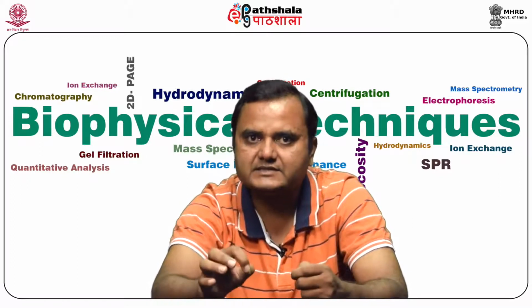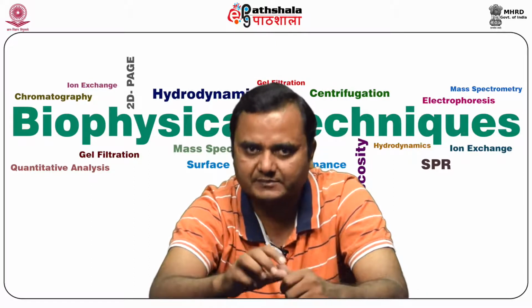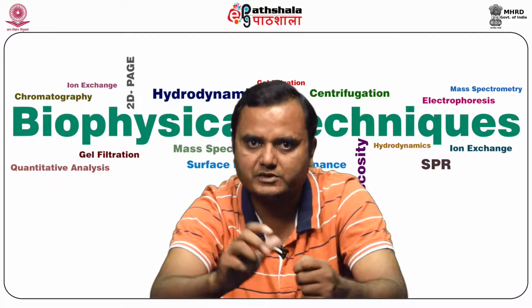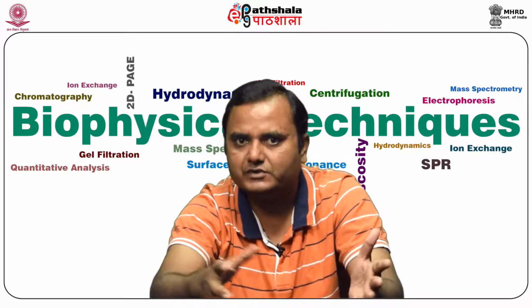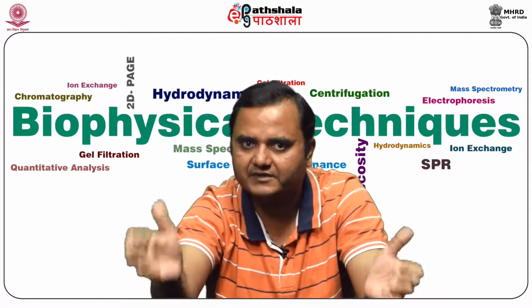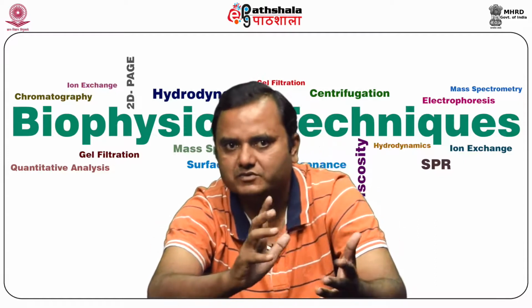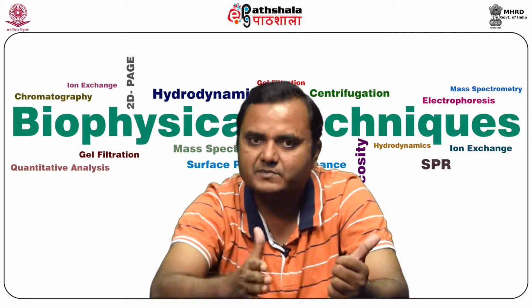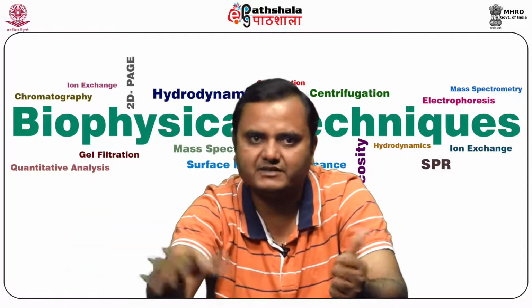However, in many cases differential centrifugation is used to separate intracellular matter, and thus this method is also an important so-called subcellular fractionation method. All the cell organelles have different density, mass or size, so once you go through the centrifugation process, these particles are separated at different speeds and can be separated one by one.